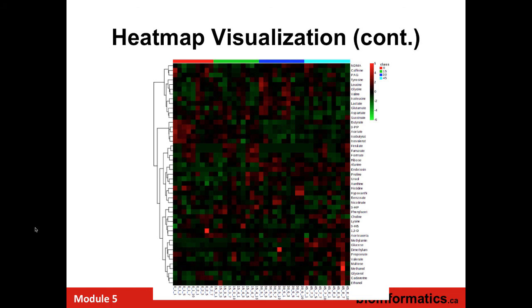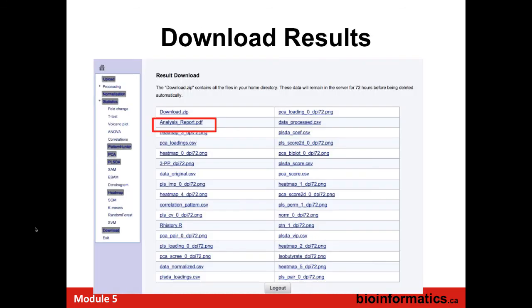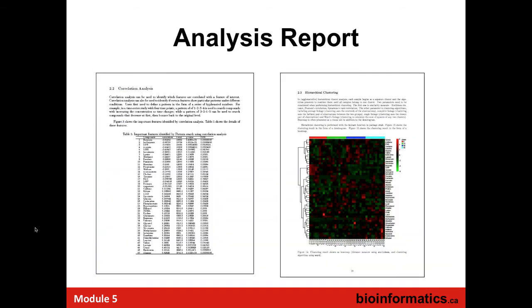So we've gone through ANOVA, we've gone through PCA, we've gone through PLSDA, we've looked at Pattern Hunter, we've done a few other tricks. So all of these have involved, you know, clicking, saving, clicking some again, making some adjustments. What's happened while you've been doing this, and what I think a lot of people appreciate, is it's keeping track of all of the graphs, all the plots, all the parameters you've chosen. So at this stage, you can ask it to write your paper. So you just press this, and there's your paper. So one comment is this.